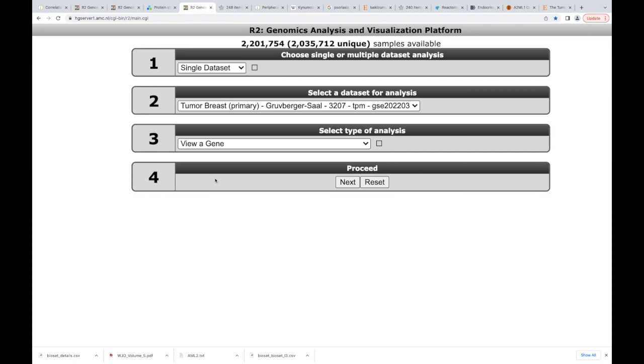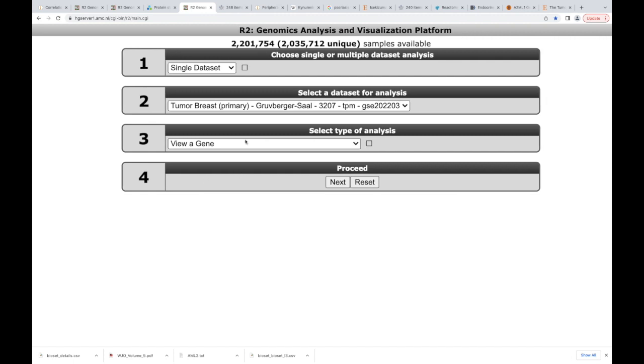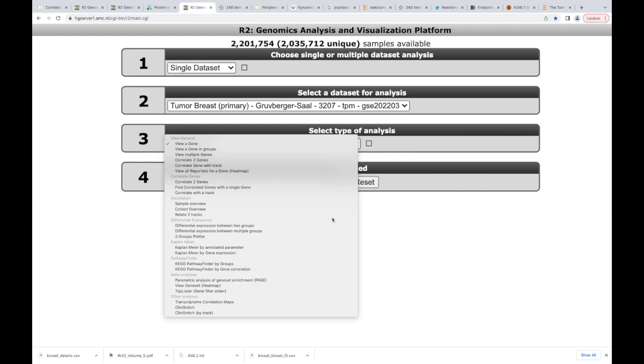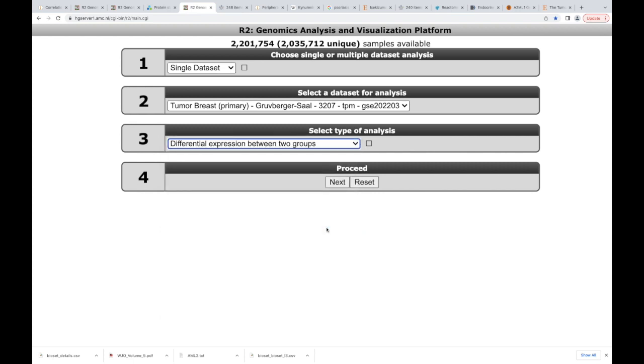So you see single data set, tumor breast. And then if I wanted to, say I was interested in a particular gene, I could basically put a gene in here. But here's what I want to do. I want to do differential expression between two groups. So I'm going to hit that. This is how easy it is to take a multimillion dollar study and use it for our own purposes.